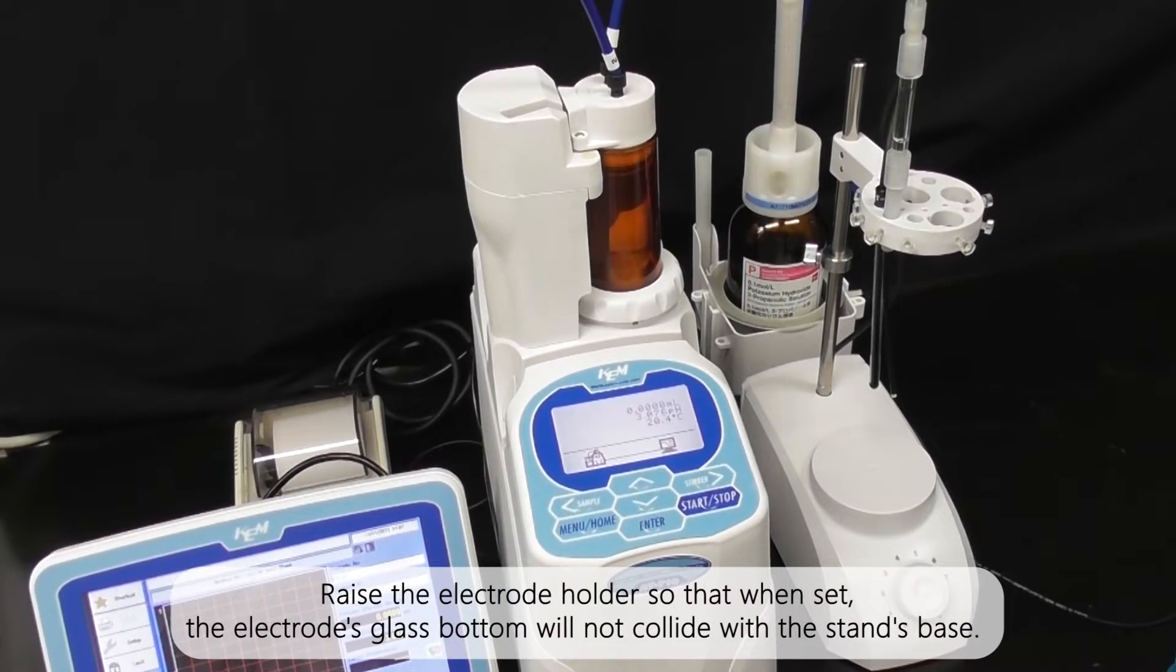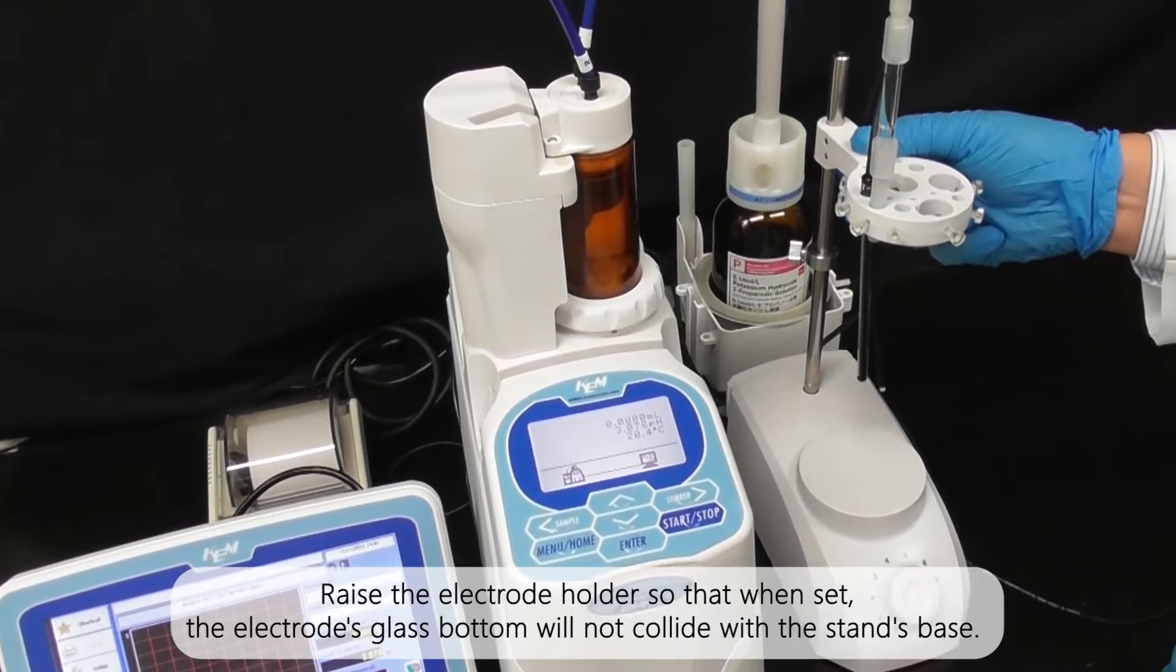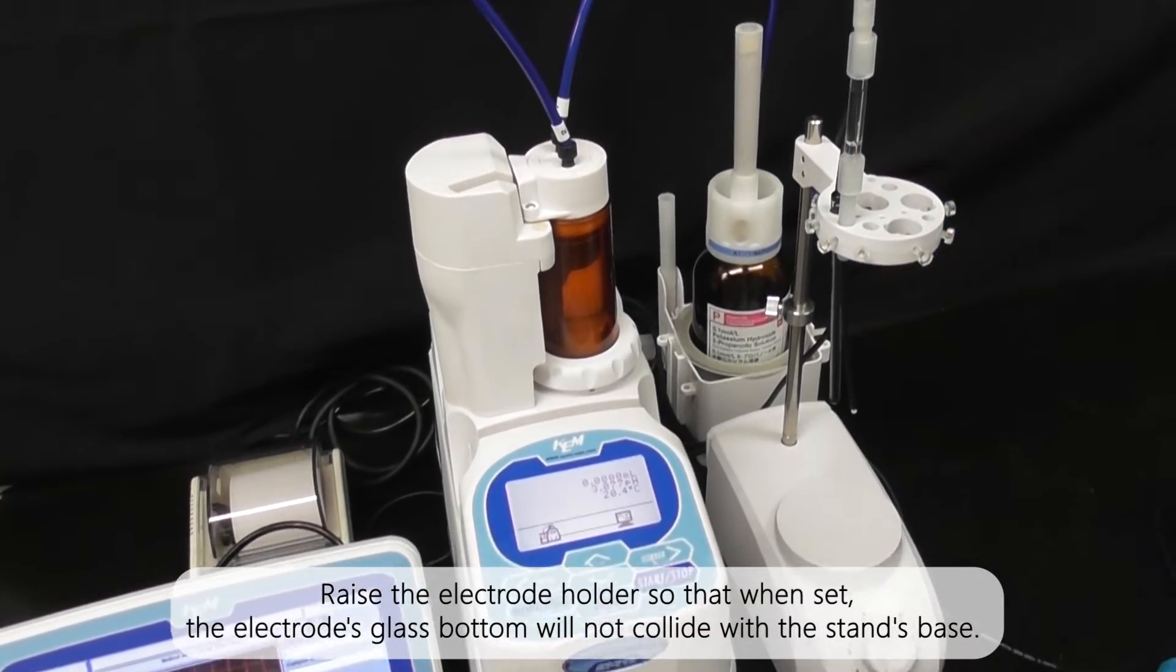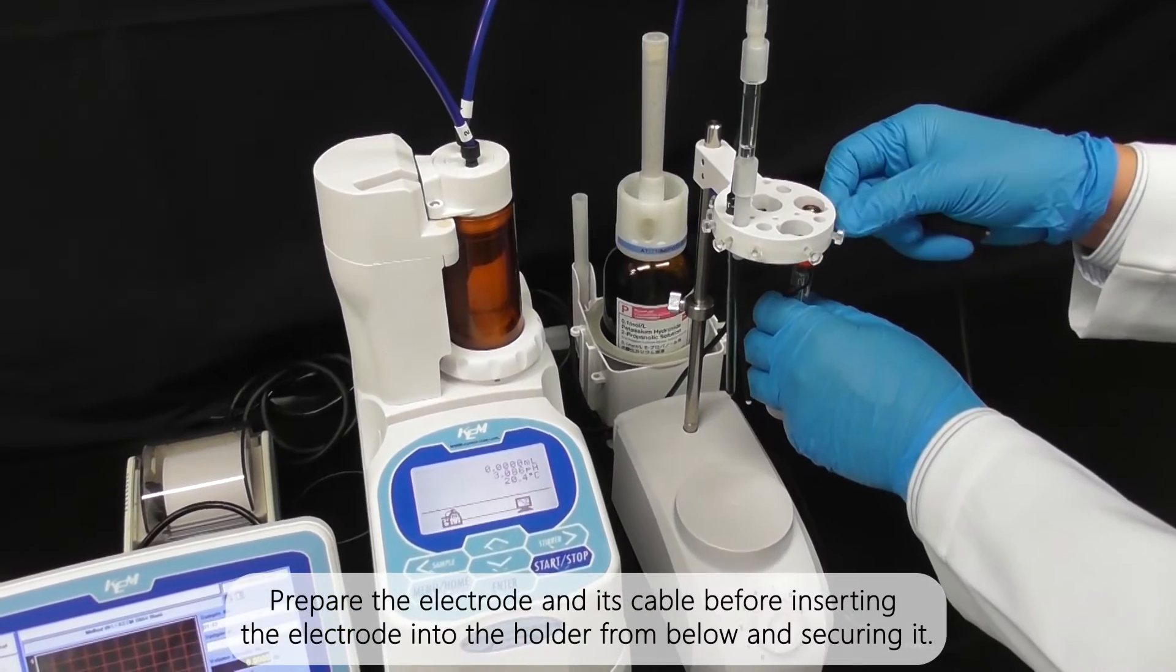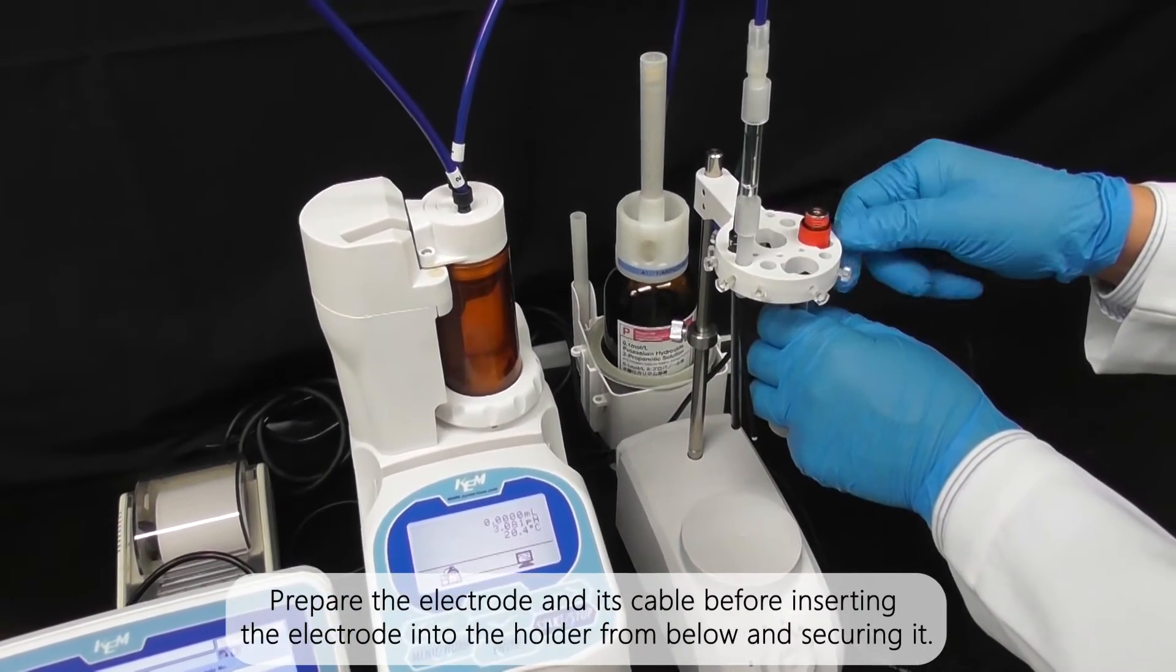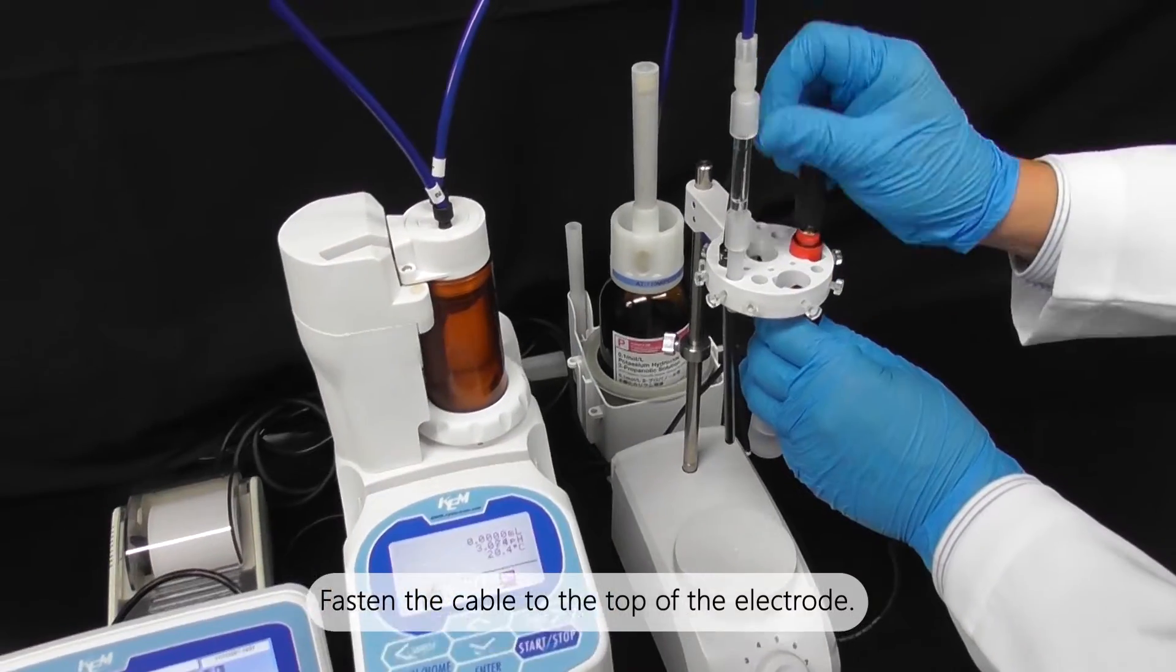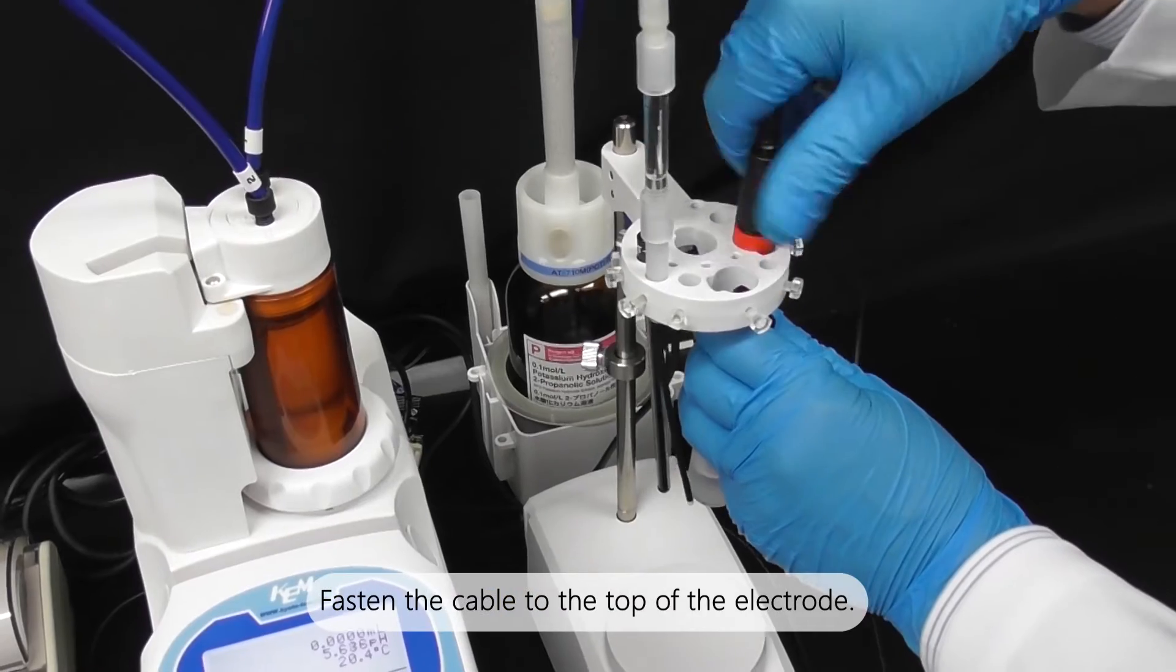Raise the electrode holder so that when set, the electrode's glass bottom will not collide with the stand's base. Prepare the electrode and its cable before inserting the electrode into the holder from below and securing it. Fasten the cable to the top of the electrode.